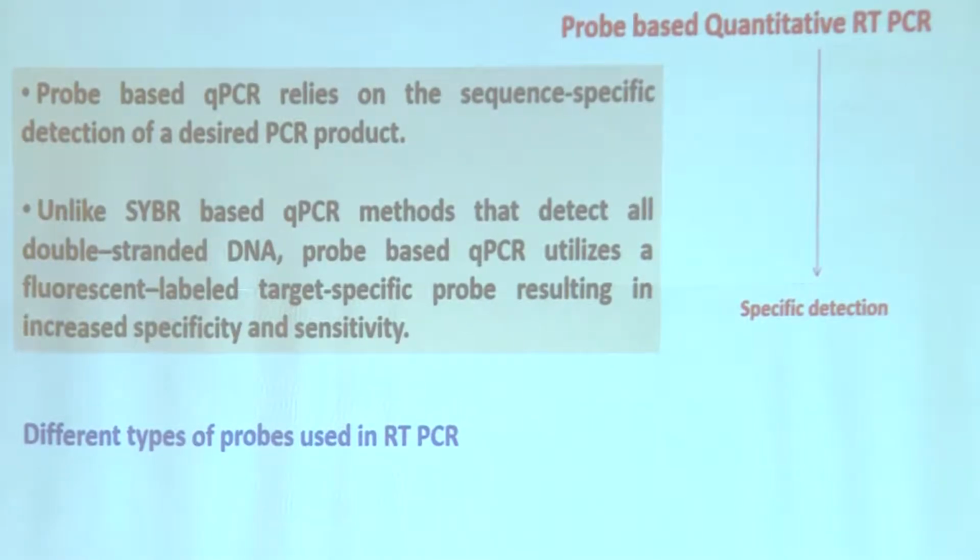Fluorescent labeled target specific probes. At this point of time, you may confuse it with the primer. We will remove that confusion after some time. What do you mean by target specific probe? It is nothing but primers only.